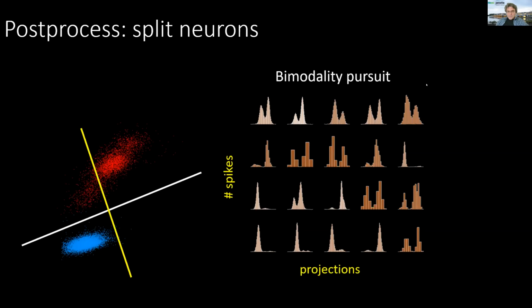How well does Kilosort deal with intrinsically bursting neurons? Burst detection. Identify bursting cells as single units. So I'm guessing usually behind this question is an assumption that the waveform changes a lot in a bursting neuron from the first spike in a burst, the second, the third, the fourth. And to that, I say, yes, it does change, but I don't think it changes a lot.